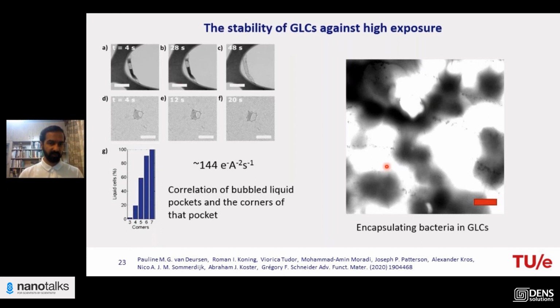The other thing was the effect of high beam, and how to calculate how the bubble formation happens in the graphene cells, and that means actually how much dose in terms of water sample in the pockets we can put for imaging.